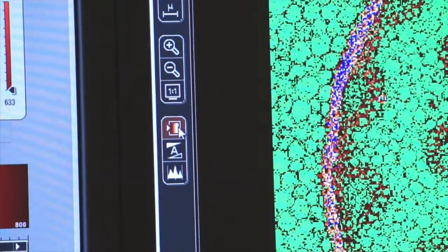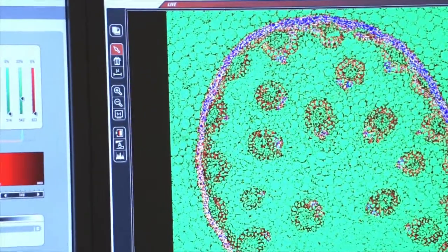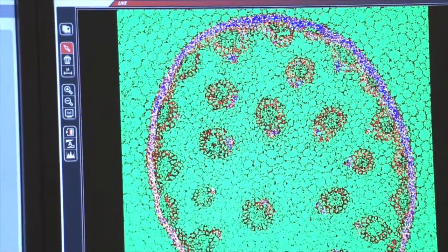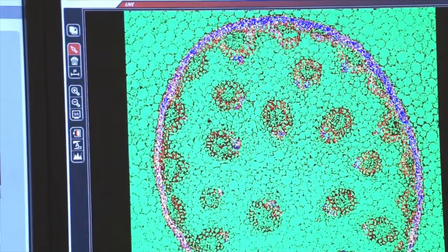You click on it once, it changes the color of your pixels to blues and greens that you can use to identify how your gain and offset should be set.